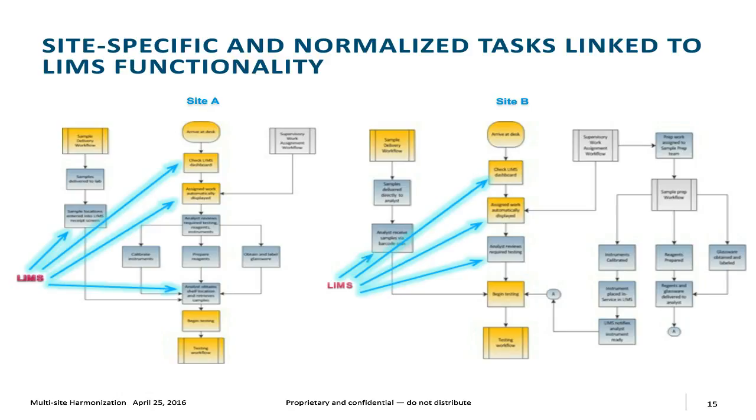All of these arrows are pointing toward the low-hanging fruit for what LIMS brings to the table. On the right side, because the workflow was slightly nuanced, slightly different, we show where an analyst actually receives the samples via barcode. On the left side, it was a sample delivery person that scanned this stuff in. On the right side, just the geographical nuance was that an analyst received these things and is bringing these things in, and scans them into the system.